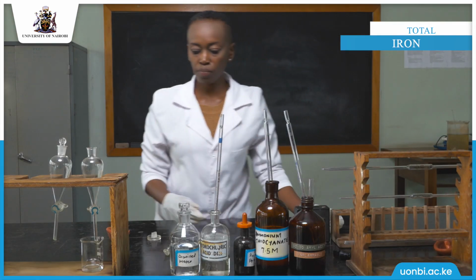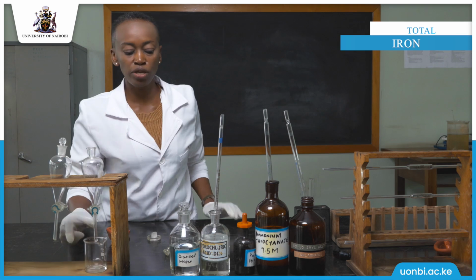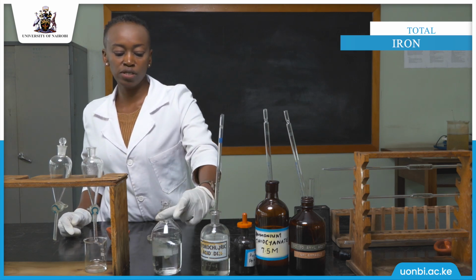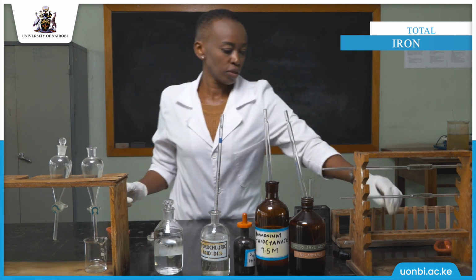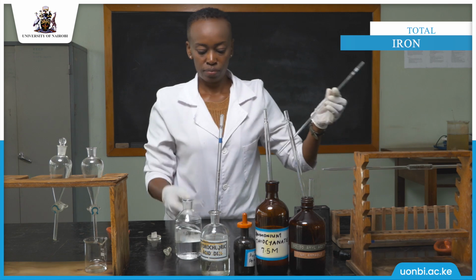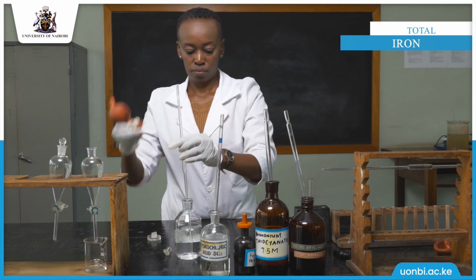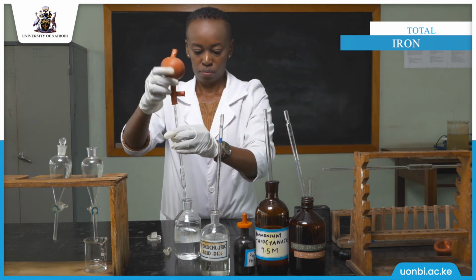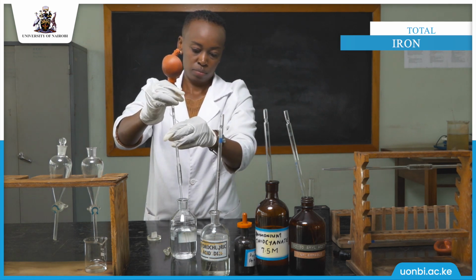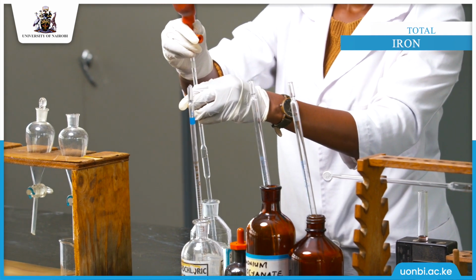Again, we are supposed to repeat the same process, now using distilled water. We'll take 5 ml of distilled water.